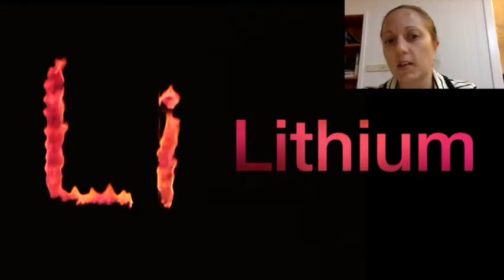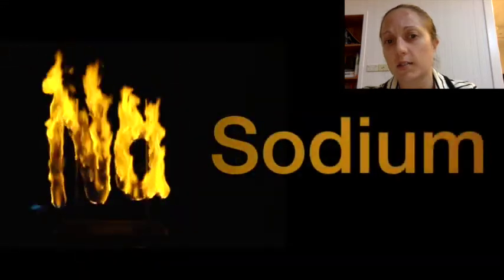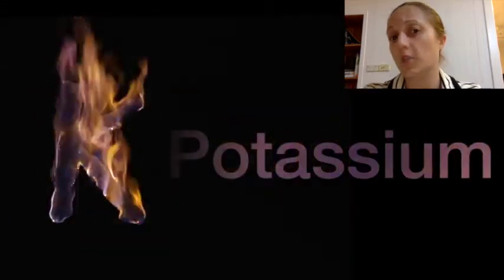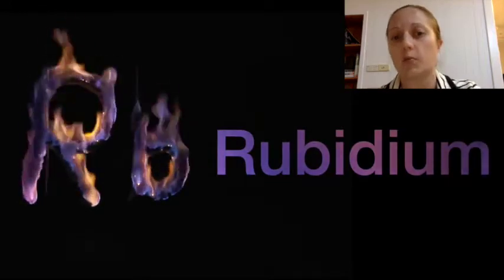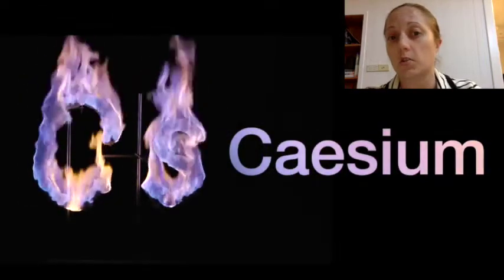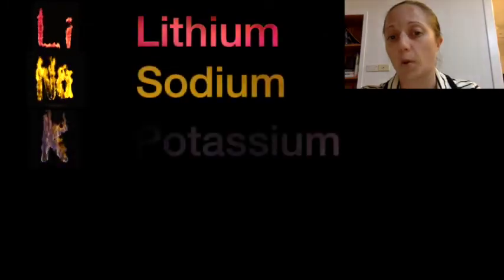So you can see the different colours according to the different atom type, and that's got to do with those energy levels that the electron can be excited to and therefore fall back from.